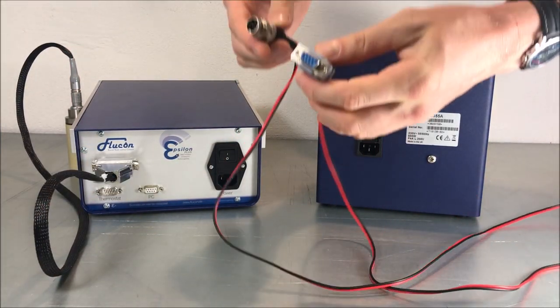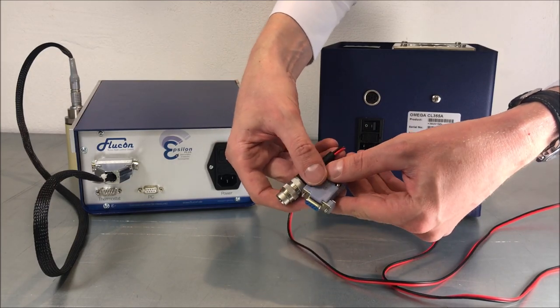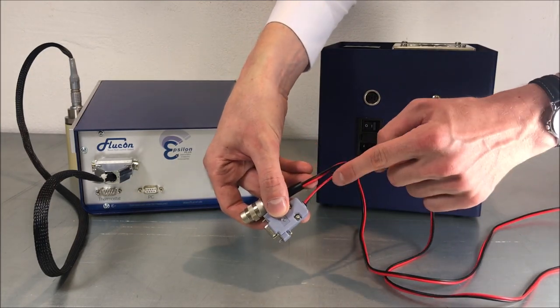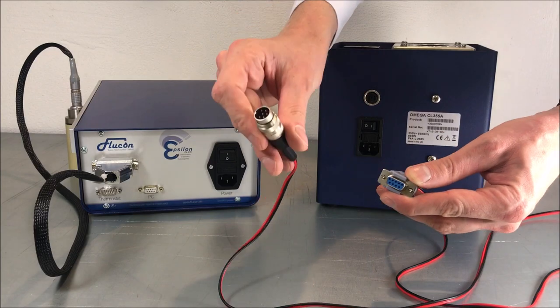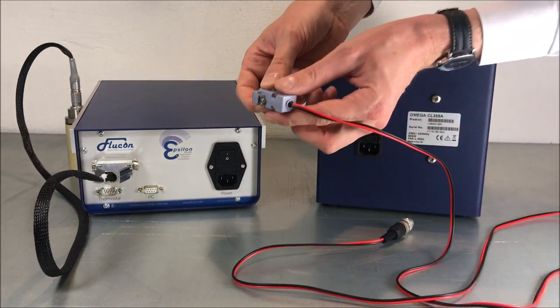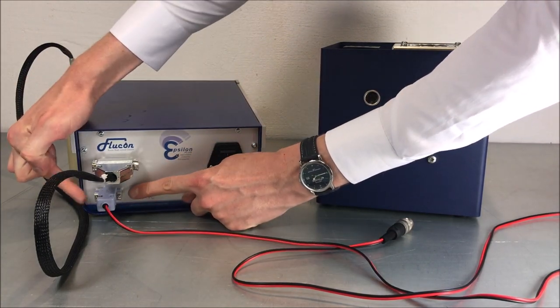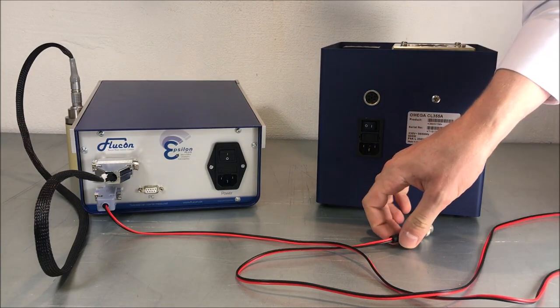After this, please connect the Epsilon Plus to the thermostat. Use the black and red cable and note that this is the thermostat plug while this is the plug for the Epsilon Plus socket. Again, use the screws on both sides to fix the connection.